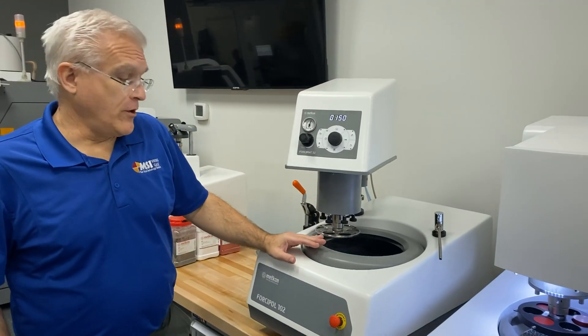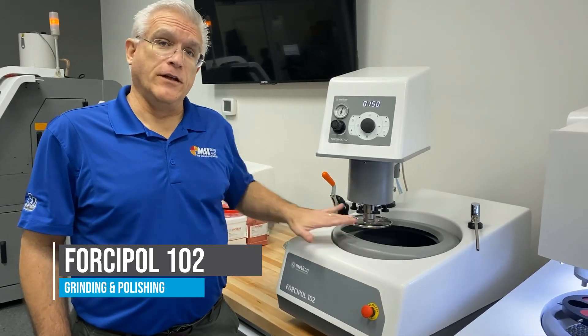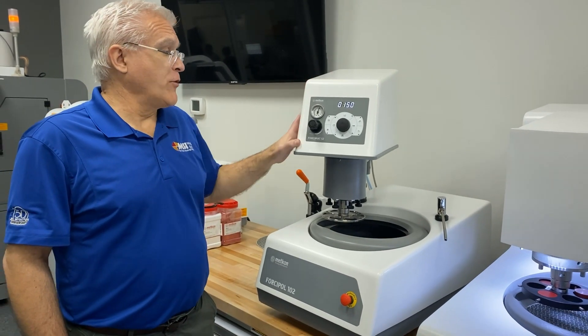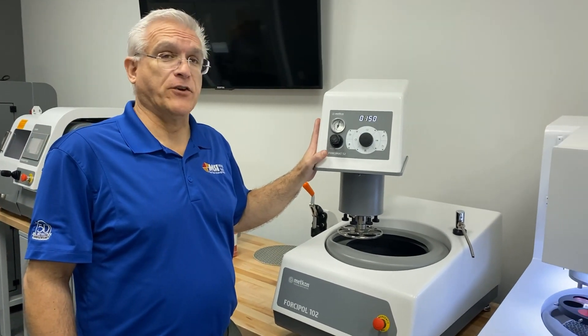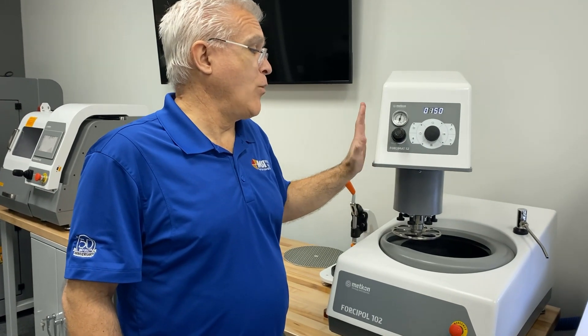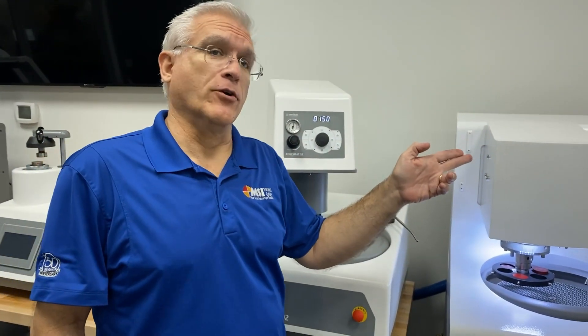We also sell the Forcipol series of polishers that are available in single and double bases with polishing heads. The Forcimat 52 is very cost effective and works beautifully when you're looking for more basic requirements. We also have a fully programmable Forcimat 102 which has a PLC similar to the Accura 102.